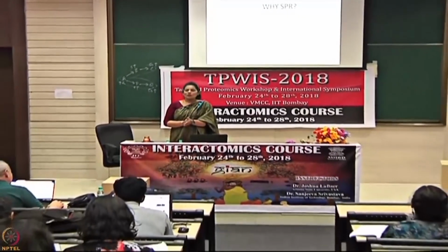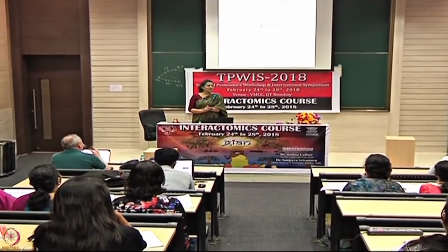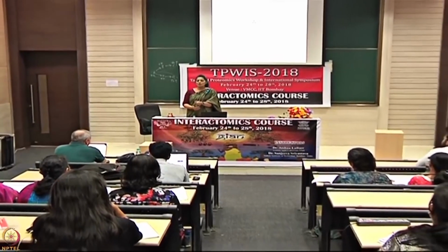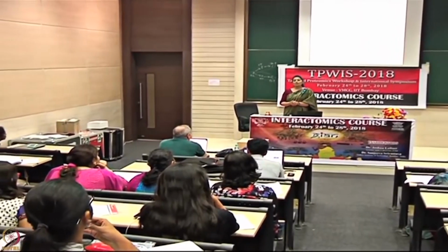Kinetics. Very good. What is kinetics? How is kinetics going to help me? Nice, kinetics, but why? How is it going to help me? Why should it help me? Why should I bother to study kinetics? I should compare the on and off rate. Very nice, but why should I compare on and off rate?